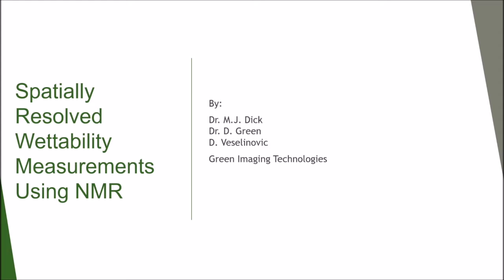This is the first in a series of 3 webinars where I will discuss work we've been doing over the last year in developing spatially resolved wettability measurement using NMR. In this first webinar, I will review how we employ NMR measurements to obtain the wettability index.